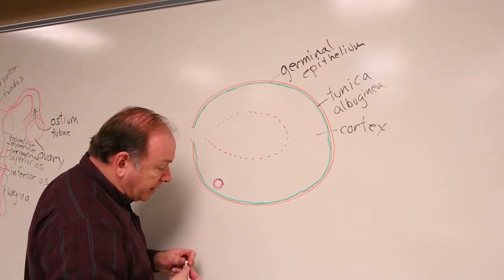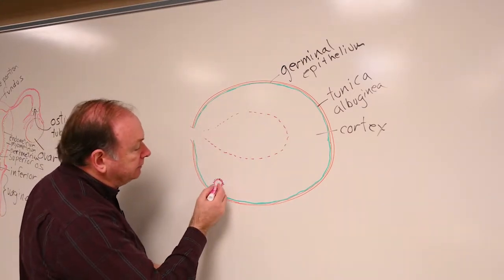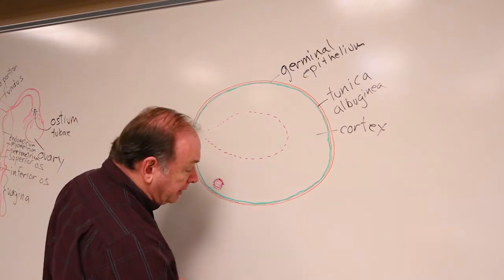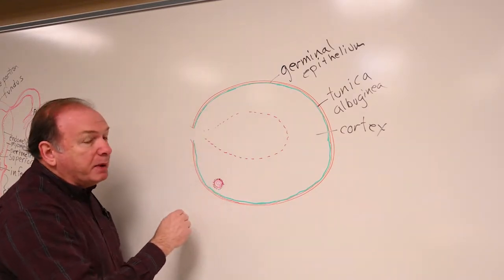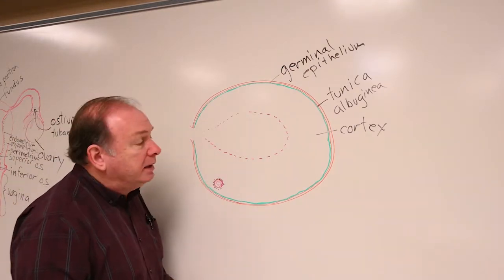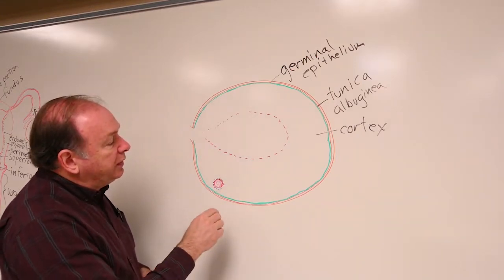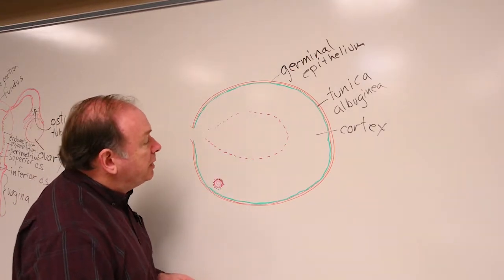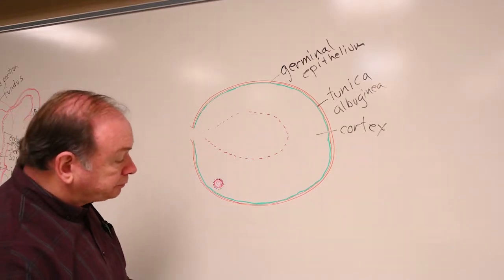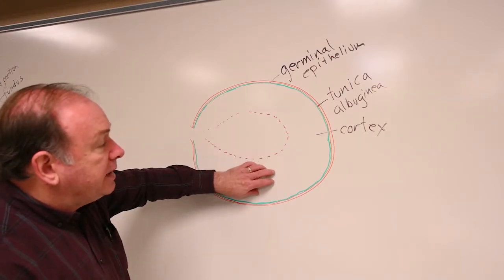In each one of these follicles, you have this large egg cell, large nucleus and large nucleolus in there, a very large cell surrounded by smaller follicle cells, those then surrounded by this highly cellular connective tissue with some smooth muscle, very few capillaries scattered through there as well. So that's the cortex, the ingredients of the cortex.